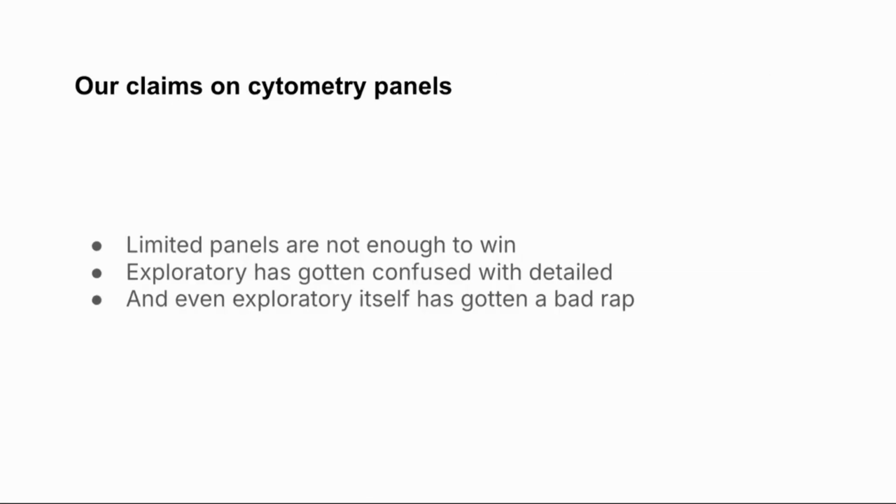So we'll make 3 claims on cytometry panels. 1, limited panels are not enough to win in terms of approvals or biomarker analysis. 2, exploratory has gotten confused with detailed. And then 3, which we're not going to cover today, but we'll give a quick preview, even exploratory itself has gotten a bad rap. Our argument is that cytometry isn't that exploratory. Single-cell RNA-seq is probably better considered exploratory versus cytometry.